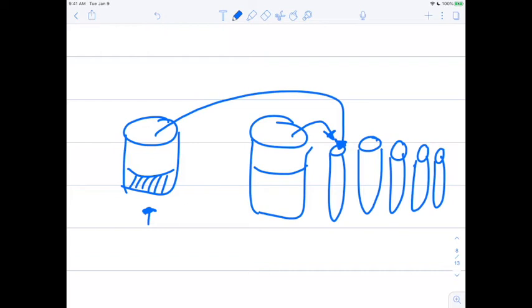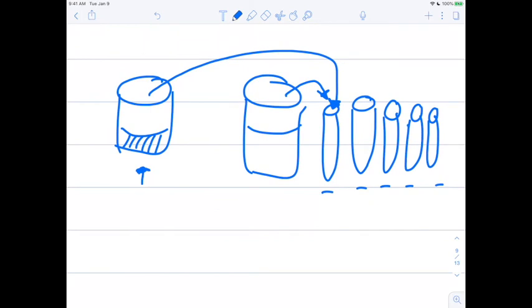And the second thing is that you could essentially make a mistake for each one of these, and they'd be different mistakes. So when we do this kind of an experiment and we're trying to make a graph that looks like so, what we find is when we do it straight out of the original solution, we tend to get a lot worse data. When we make our stock solution first, we get a nice straight line. Now, sometimes that line is a little off of where it should be. And that could happen if whomever in your group made the solution might have made a mistake, but you still get a nice straight line because it's a consistent mistake through everything.